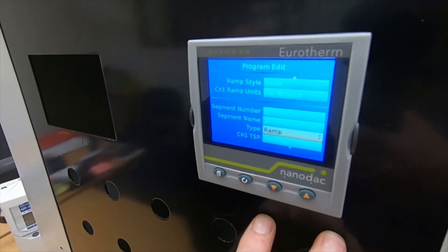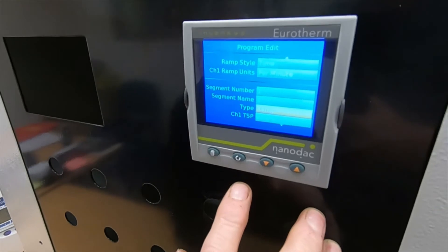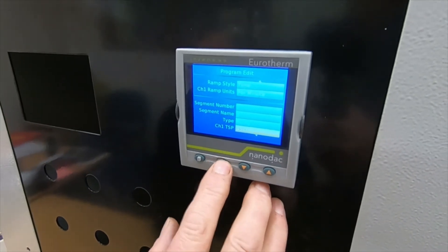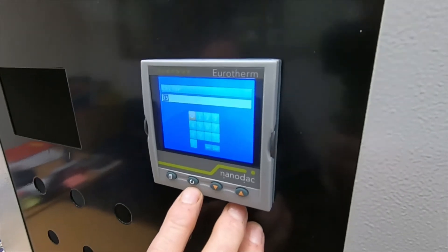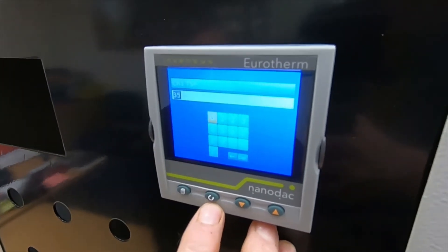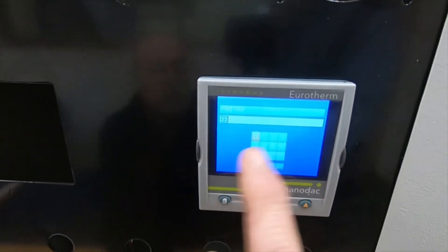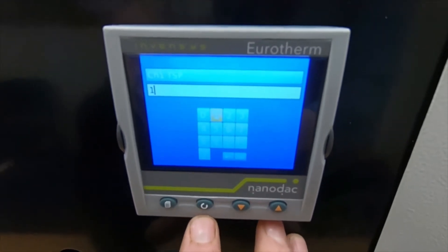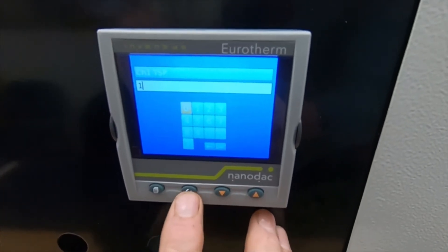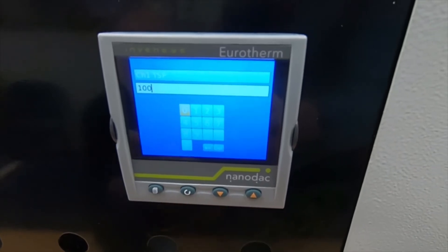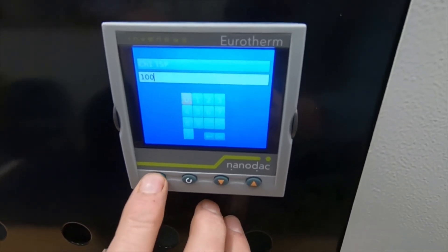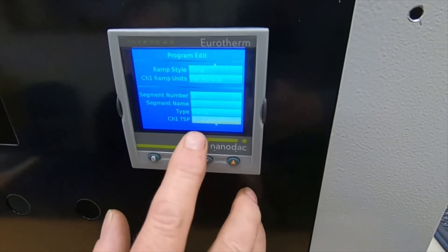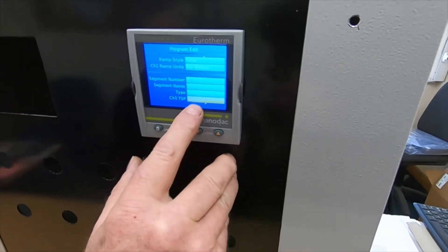In this first instance it's a ramp, so press your scroll button to accept that. Now your target set point — if you want to go to 100 degrees, this is the temperature the oven will be at at the end of the ramp. Press the scroll button to select it. Use your cursors and press the scroll button to highlight — at the top it shows 1. We want to select 100, so press the scroll button twice. To accept, press the page button first, then use your cursor to select yes, and scroll button to confirm. The channel one target set point is now 100 degrees.